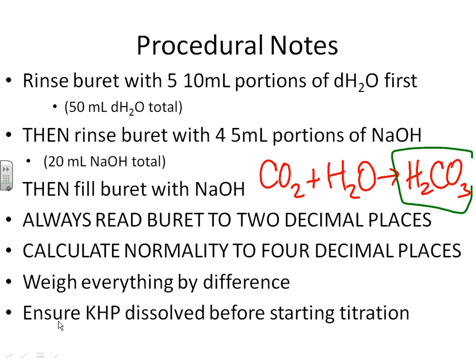Now, if I boil the water, it causes the carbon dioxide to come out of solution because gases are most soluble under low temperatures, again, cold soda. So by boiling the water, it encourages the carbon dioxide to leave and thus gets rid of any carbonic acid that might be in the distilled water.